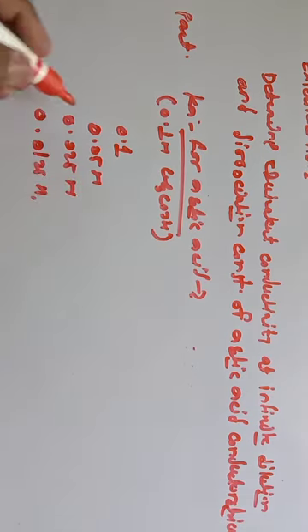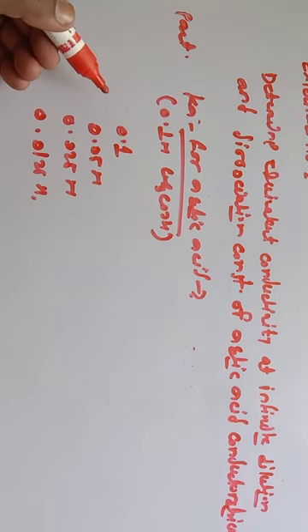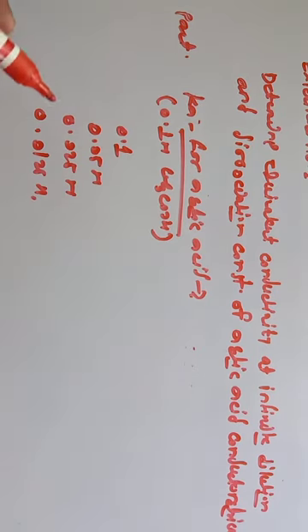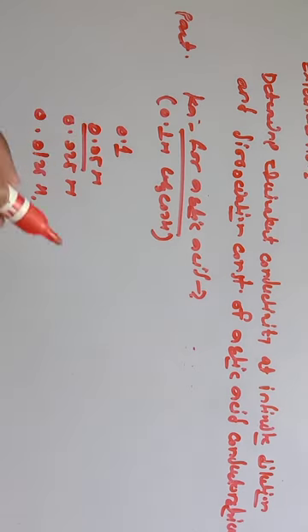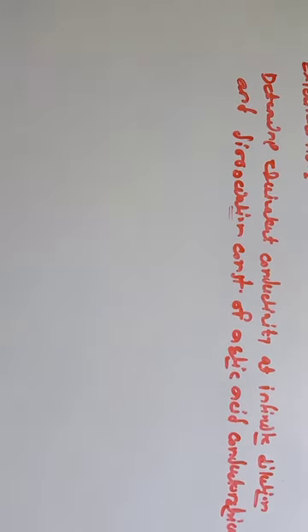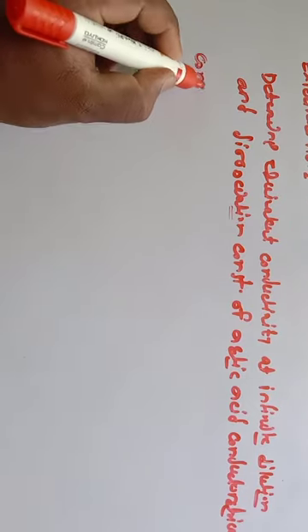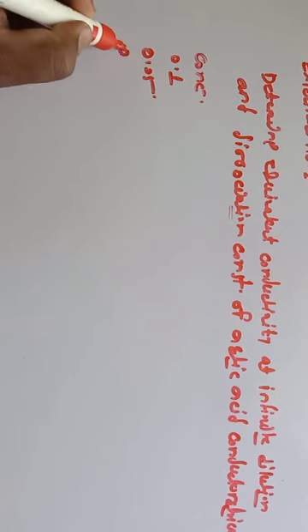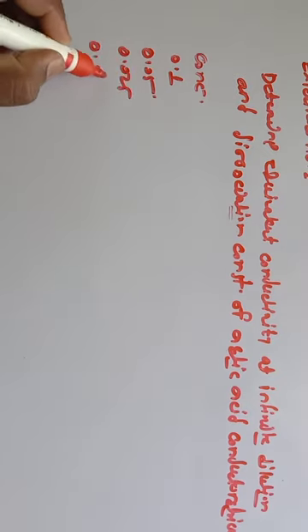So the preparation from the stock solution is very simple. You have to use this formula, that is N1 V1 equal to N2 V2. So N1 is your known concentration, V1 is what you find out, N2 is the concentration you prepare, such as 0.05, and V2 is how much you prepare. With the help of this formula, you prepare these different concentrations and measure the conductance of these solutions. In the observation table we require the concentration, that is 0.1 normal, then 0.05, 0.025, and 0.0125.